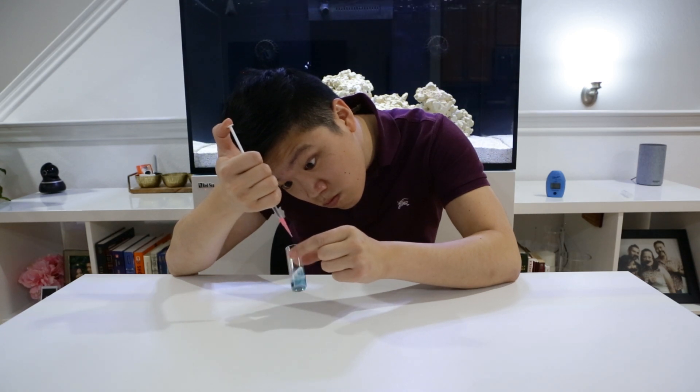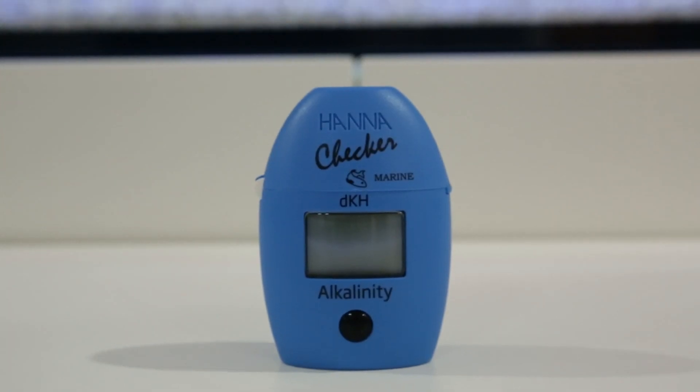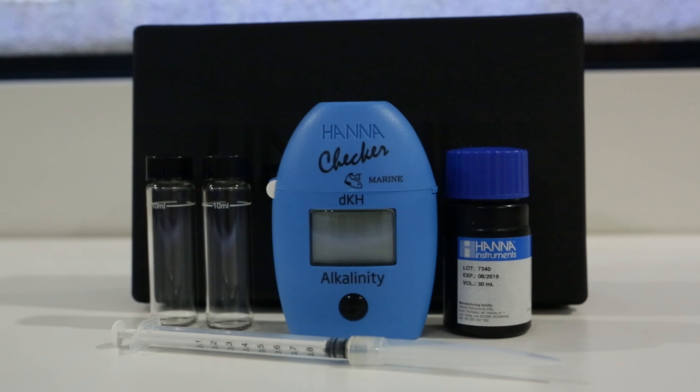Hey, are you tired of performing time-consuming alkalinity checks on your reef tank, often over-dripping your test solution and getting inconsistent readings? Well look no further, we have the alkalinity testing solution for you. With the HANA DKH colorimeter, you can get reliable results in as easy as 1, 2, 3.